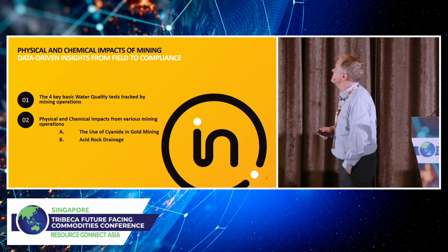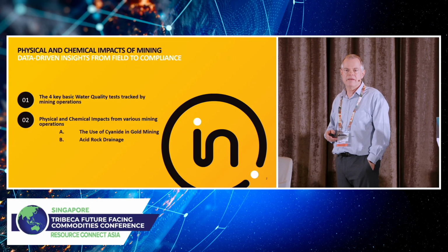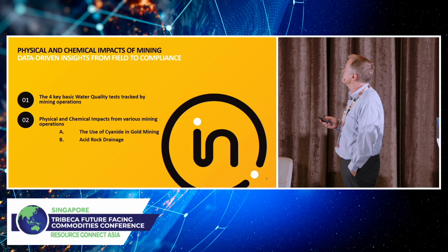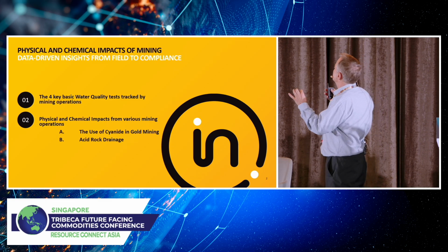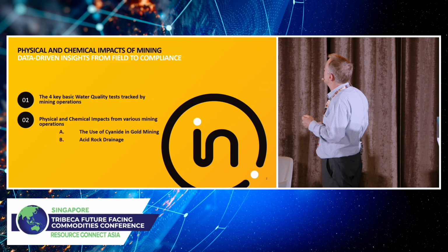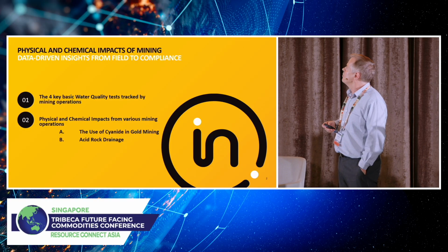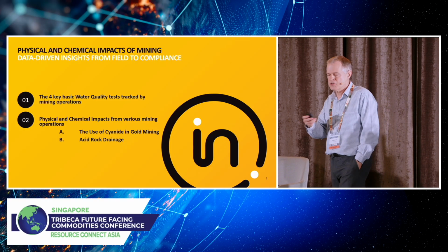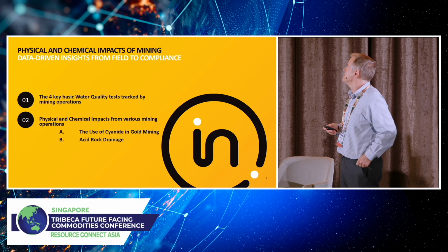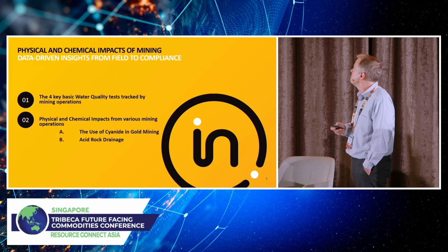I'm going to talk about the 4 key basic water quality tests that mining companies like to use to monitor their environmental impacts. And then I'm going to zero in on 2 specific chemical impacts. I'm going to talk about the use of cyanide in gold mining, and I'm going to talk about acid rock drainage, also known as acid mine drainage. This is a very significant impact which many mines face that are unlucky enough to have this particular problem.